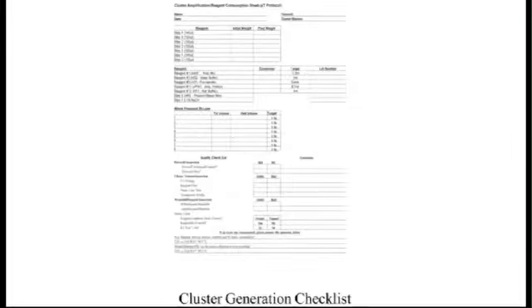We use this cluster generation checklist throughout the cluster amplification process to record very detailed information each time we perform the process. A similar checklist is used during the LBPA module of the process. Once we've filled the strip tubes, we weigh them both before and after use.